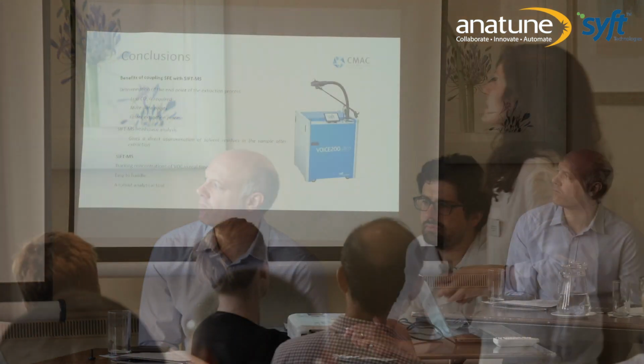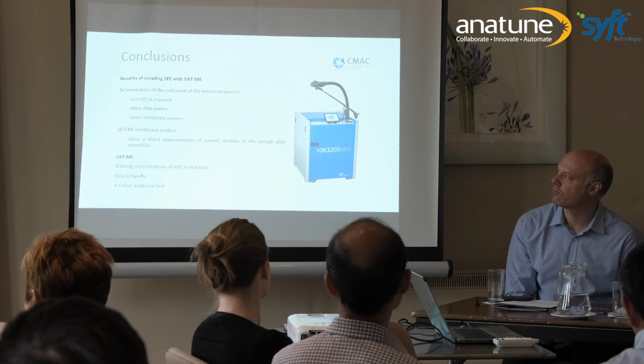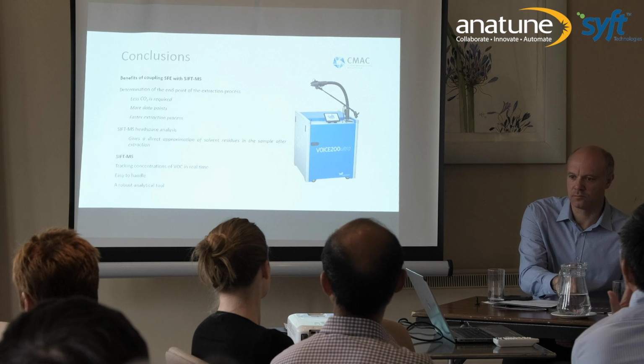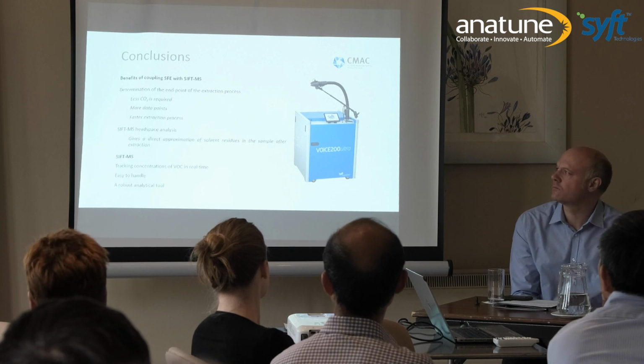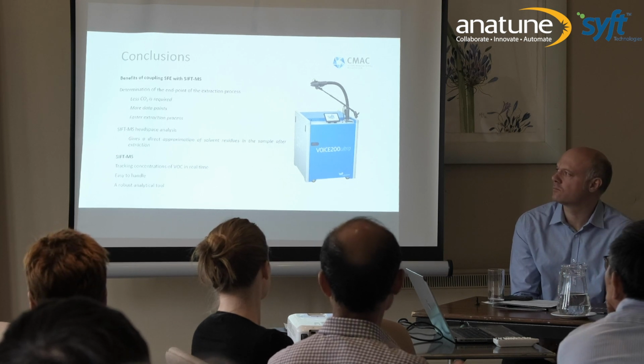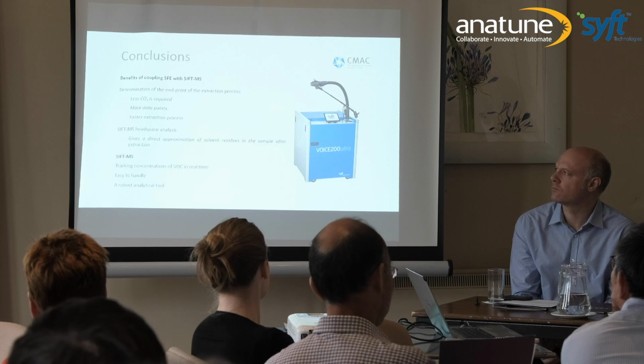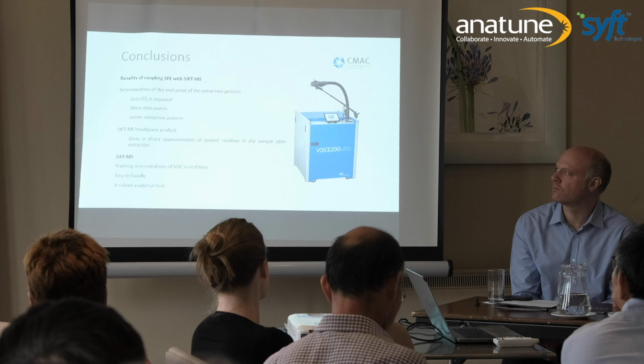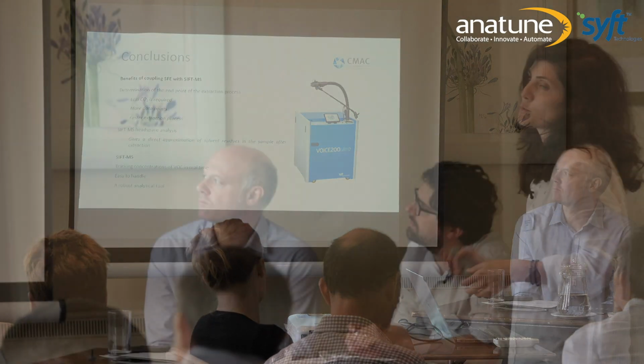So to conclude, using SIFT-MS, we can easily determine the endpoint of the extraction process, and we can change our methodology and spend less CO2, get more data points, and the extraction is faster. And also with SIFT-MS headspace analysis, we can have a rough approximation of whether the sample is dry or not from the solvents.